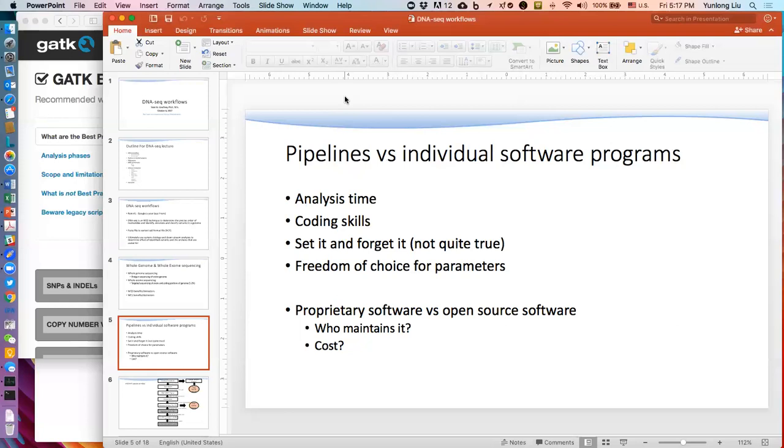Because there are labs out there that only live and die by HG19, which is the long-standing human genome, and now HG38's online, and some of the subtleties of it are different, and they're gonna produce very different results. So there are wonderful properties to having the ability to take a FASTQ, plug it into a pipeline, start it, and then let it run and come out with a VCF, but there are also subtleties that come along with maintaining it, caring for it, making sure it's reliable and reproducible, okay?